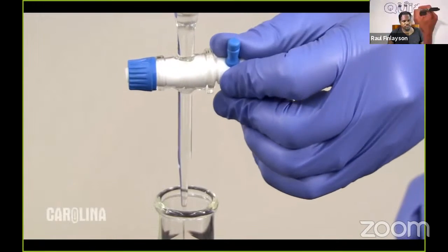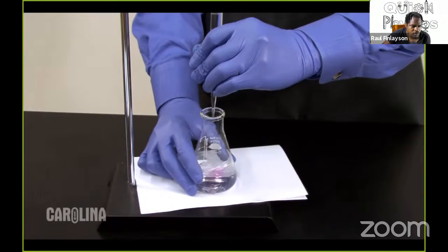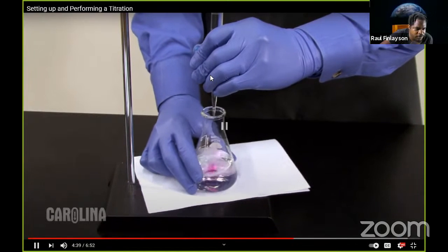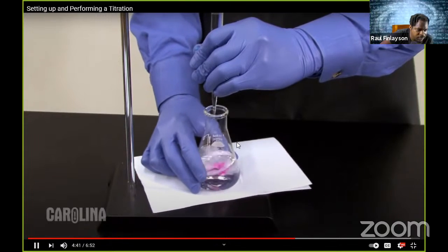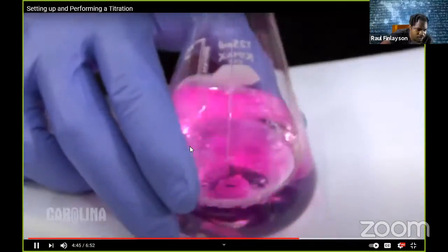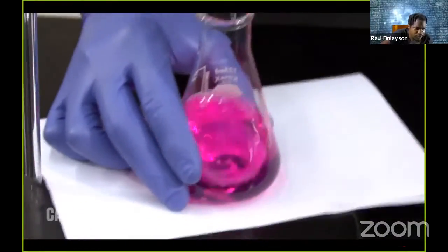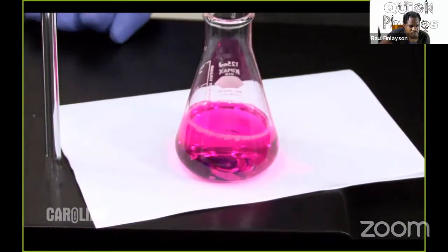It is common laboratory practice that the first titration is an estimate. Open up the stopcock and allow the titrant to enter the flask quickly. You realize that the color in there is coming and going? Continuously swirl the flask. As the volume of titrant in the flask increases, the color of the indicator appears, then disappears as you swirl. When the analyte becomes a colored solution, close the stopcock.